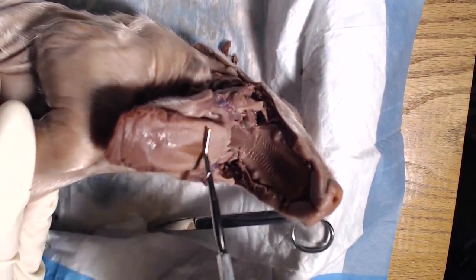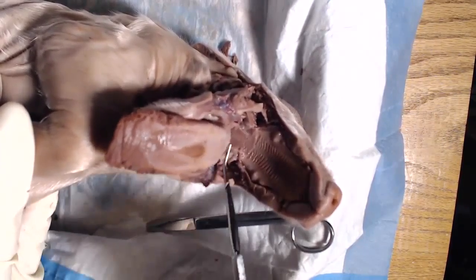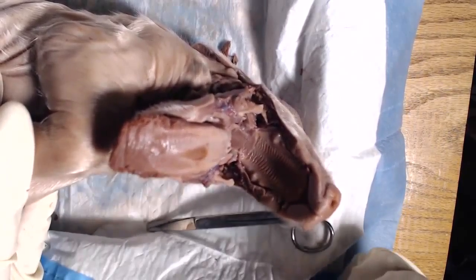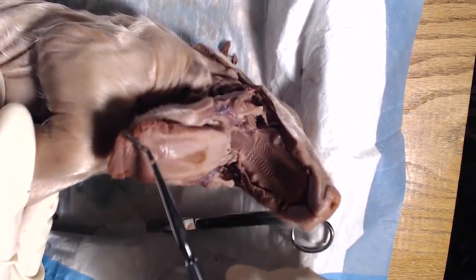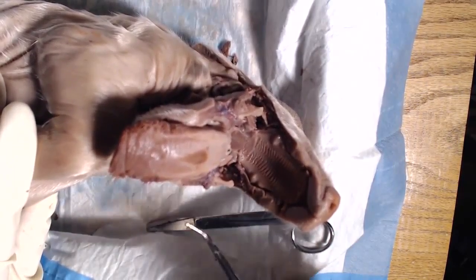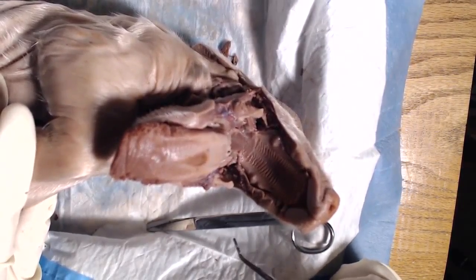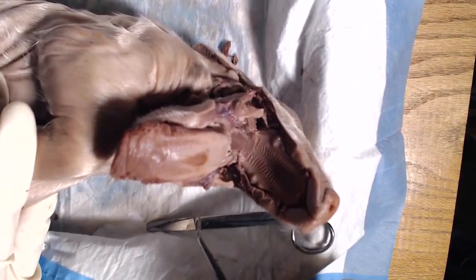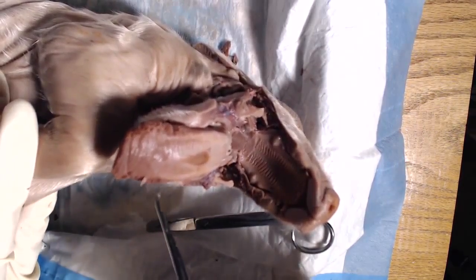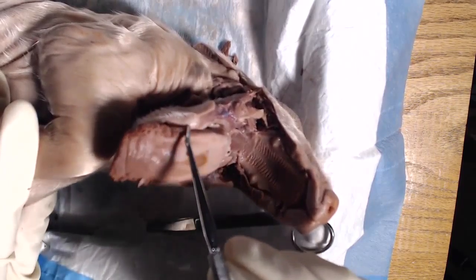All right, and also we have this large structure here, which is the tongue, of course. And you can see little bumps on the tongue, which are the lingual papillae. These lingual papillae contain taste buds most of the time, except for the one specific kind that does not contain taste buds, which is the filiform kind. So try to identify these little bumps, these lingual papillae, on the tongue of your pig.